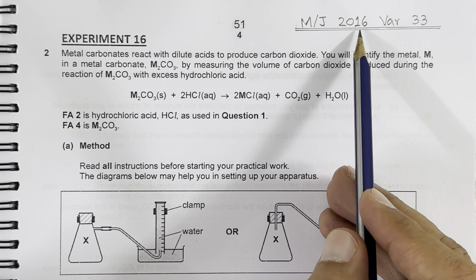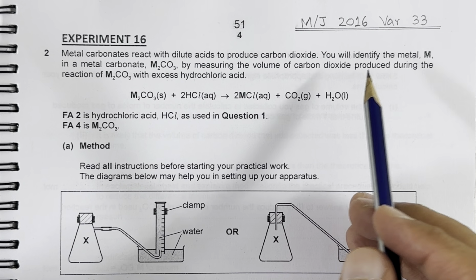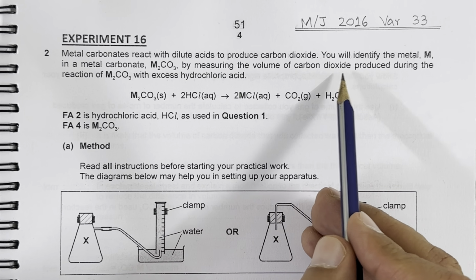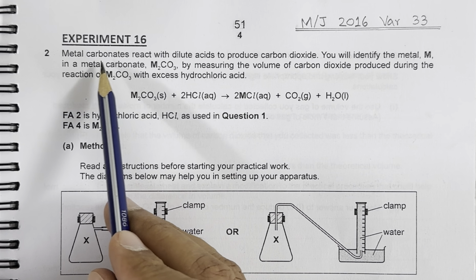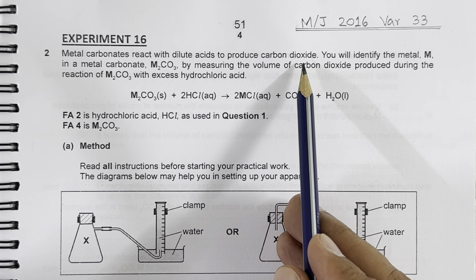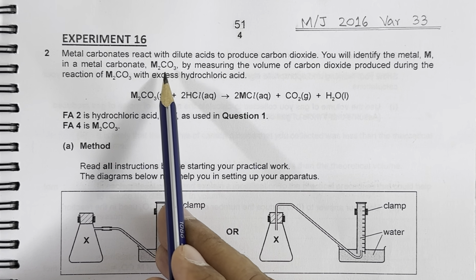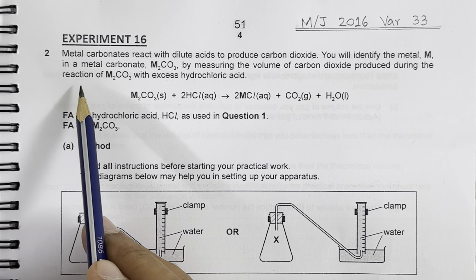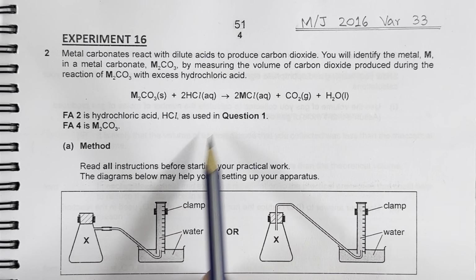May-June 2016, variant 33. The experiment is about the identification of metal in metal carbonate by measuring the volume of carbon dioxide collected. So the experiment starts from here. Metal carbonates react with dilute acids to produce carbon dioxide. You will identify the metal M in the metal carbonate, M2CO3, by measuring the volume of carbon dioxide produced during the reaction of M2CO3 with excess hydrochloric acid. The equation is also given.